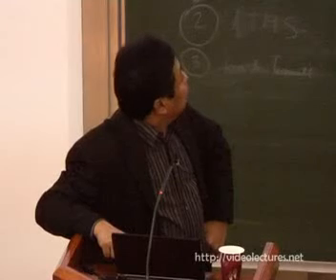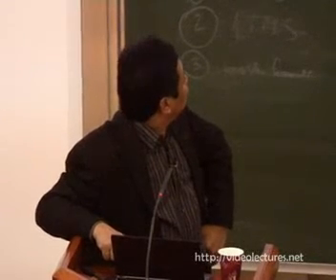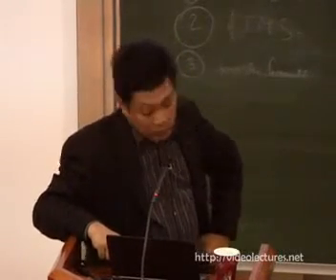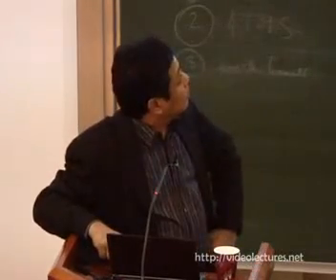And we are mainly working on metallic samples because they are easy to prepare and easy to work with. And the molecules I'm going to talk about are deposited by using home-built Knudsen cells, or recently we are also depositing by means of a pulse injection technique.